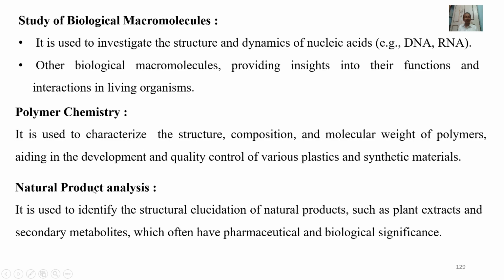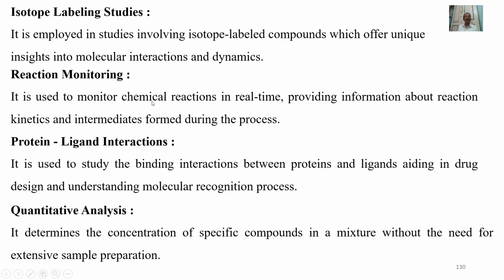Natural product analysis. It is used for the structural elucidation of natural products such as plant extracts and secondary metabolites, which often have pharmaceutical and biological significance. Isotope labeling studies. It is employed in studies involving isotope labeled compounds, which offer unique insights into molecular interactions and dynamics.